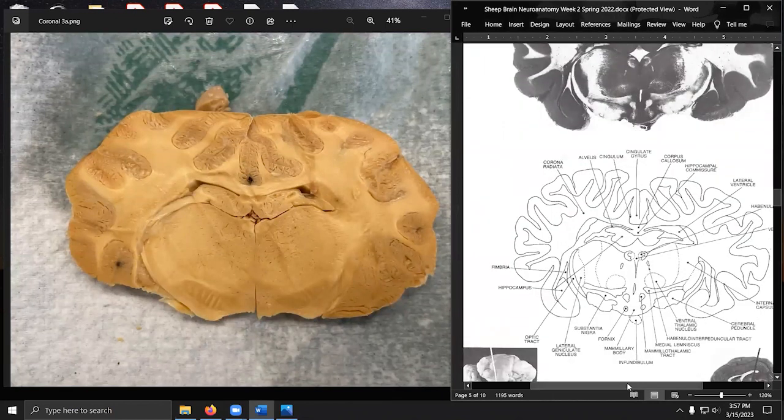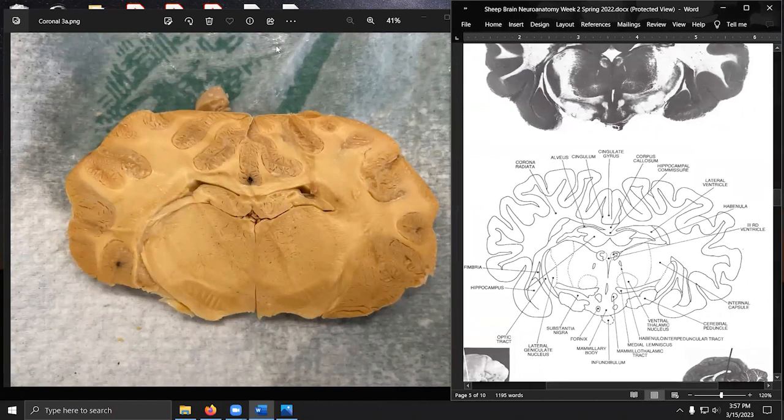In this case, we have a few new players and a few returning players. Let's go ahead and draw some. Corpus callosum basically is returning right here, as we'd figure. This is no longer the body of the fornix. It actually has become more convoluted and has become hippocampus. So we have hippocampus here, here, and additionally, it does make an appearance in lower parts. For instance, it does happen to be appearing right about here as a sliver. So we could kind of trace its pathway. You'll notice over here it says fimbria. This is connective tissue that helps to link the hippocampus subregions up a bit. So the fimbria would be places like right around up here and here.